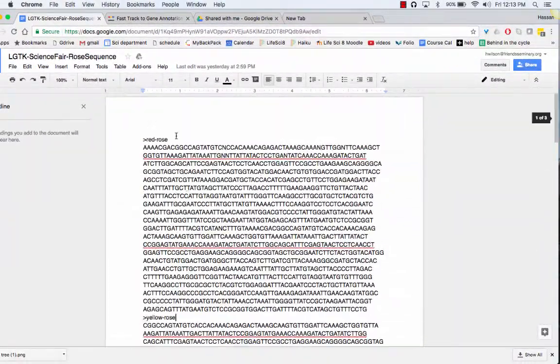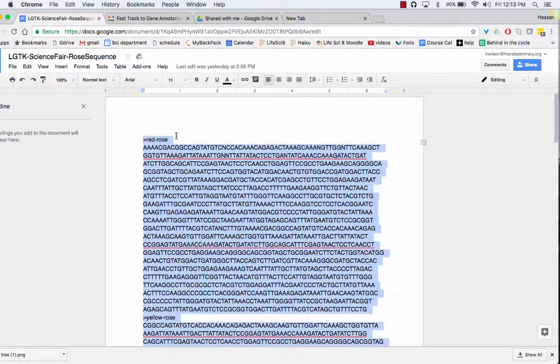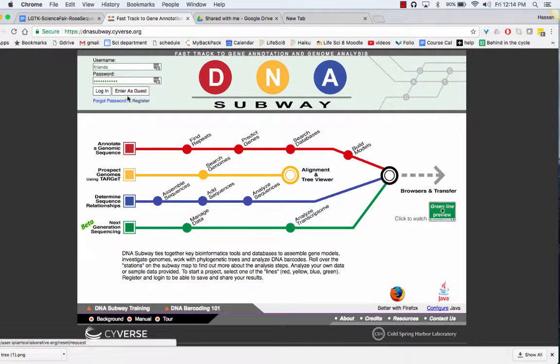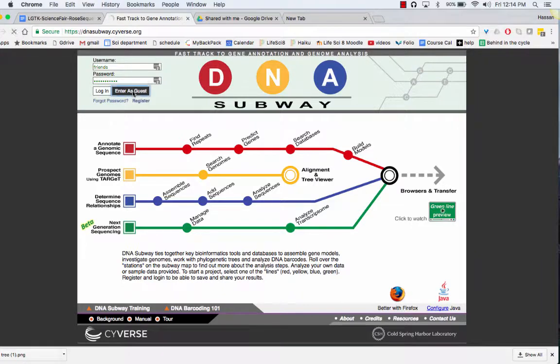So I'm going to select and copy these sequences. You can create an account if you want or you can enter as a guest.